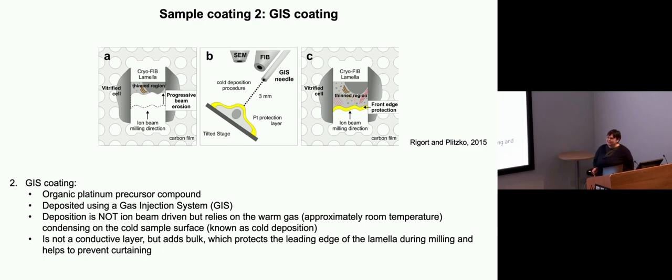By having this layer, it protects the front from breakage and it also helps protect against curtaining. These are these stripes that you see on the surface of lamellae caused by differential milling rates of different things in your sample. And again, this doesn't eliminate it, but it helps reduce it.